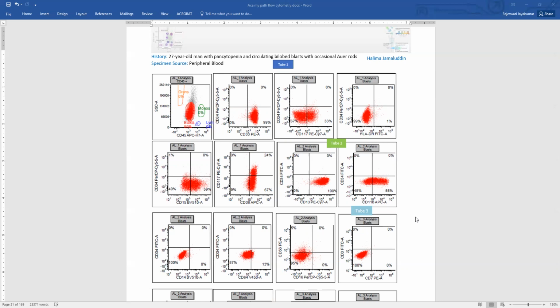One thing that you have to remember is that a similar phenotype can be seen in NPM1 and FLT3 mutated AMLs, but those usually do not have very high side scatter, they have low side scatter, and they might have some monocytic markers also. And your morphology helps. APL will have bilobed blasts, they can have Auer rods if you're lucky. And NPM1 and FLT3 mutated AMLs usually have the fish-mouth or cup-shaped blasts, and that helps, and low side scatter helps. But otherwise, when you see this phenotype, immediately alert your clinician and rush your FISH studies.